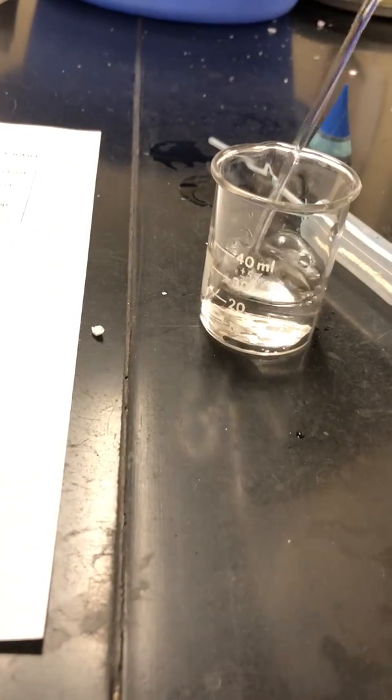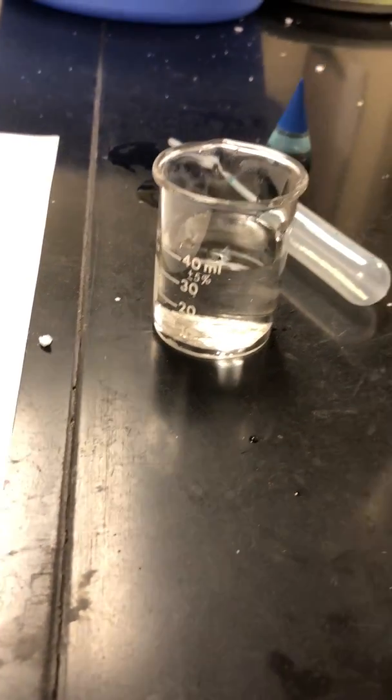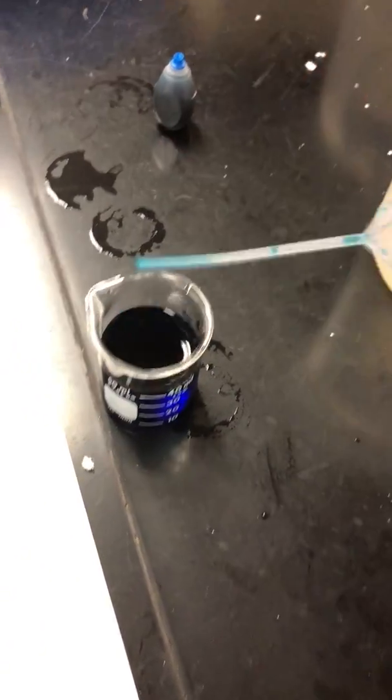Yeah, sorry, this is hard to do one-handed. There we go. Get your 40 mils of cold water. Beautiful. Add 2 drops of blue to the cold, and stir with the end of the pipette. Done.